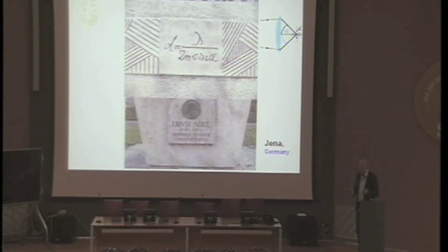Now, this equation can be found basically in any textbook of optics, of course, but also in textbooks of molecular and cell biology because of the enormous relevance of light microscopy to these fields. And the relevance is very clear. If you want to look inside a cell, a living cell perhaps, or even living tissues in 3 dimensions, there's no alternative to using a light microscope that just uses a regular lens and regularly focused light.